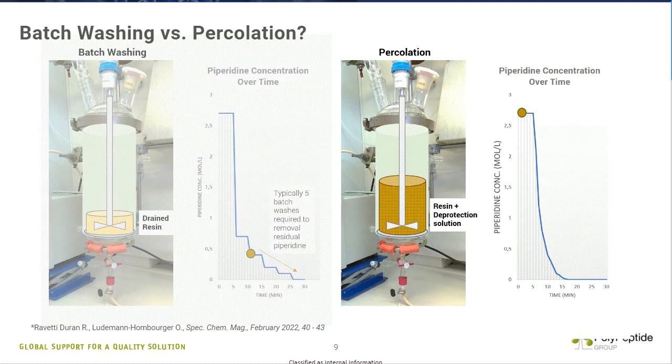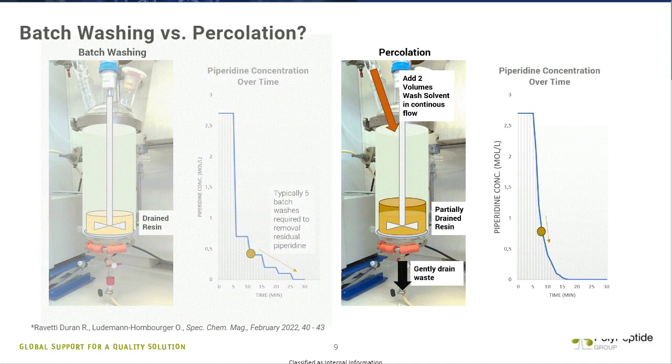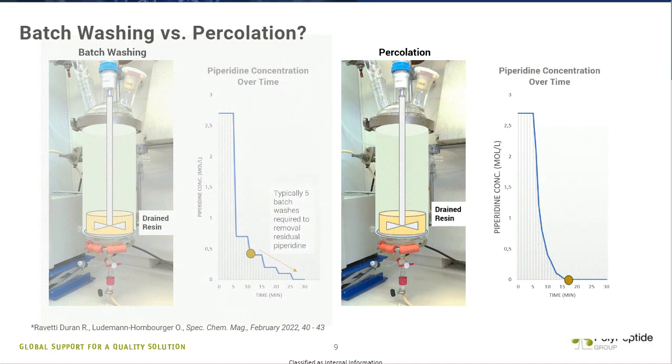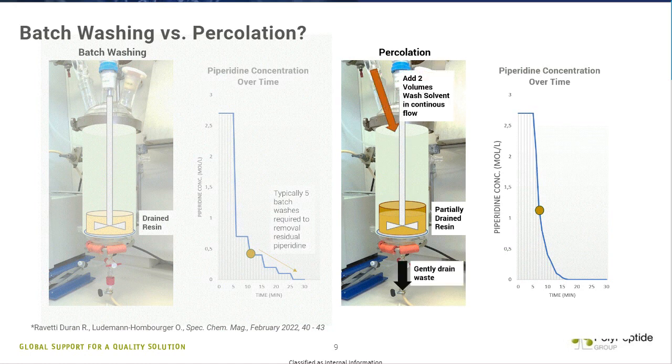This is definitely a straightforward peptide in some ways because it's linear, it's natural amino acids, and it has N and C termini that are essentially standard. So we would probably not apply the same development strategy for a peptide that's over 50 amino acids or that has maybe a cyclic structure, for example.